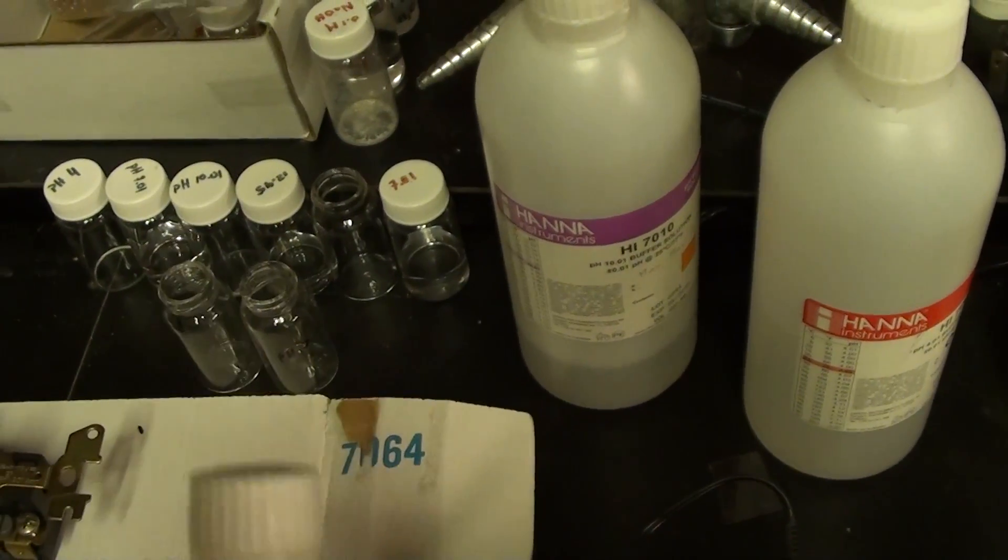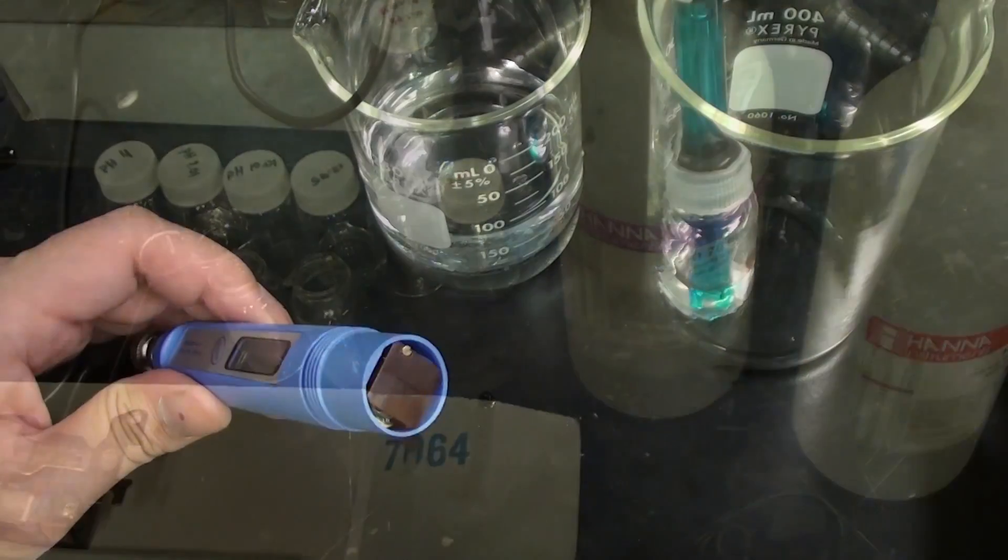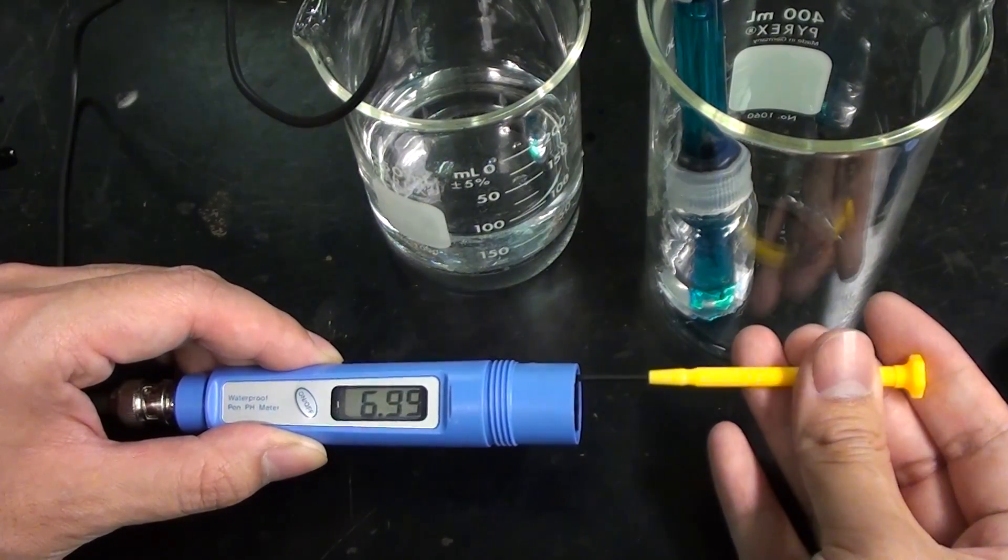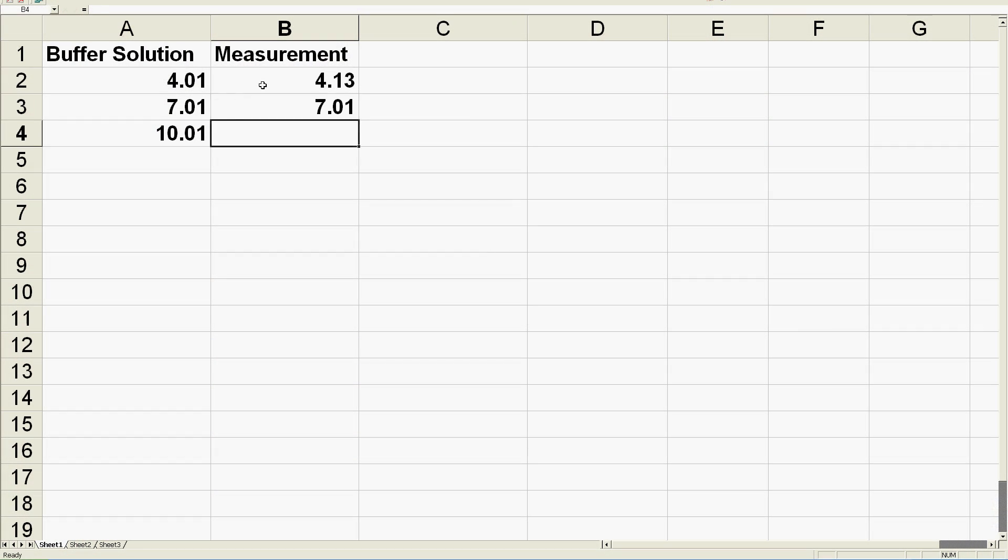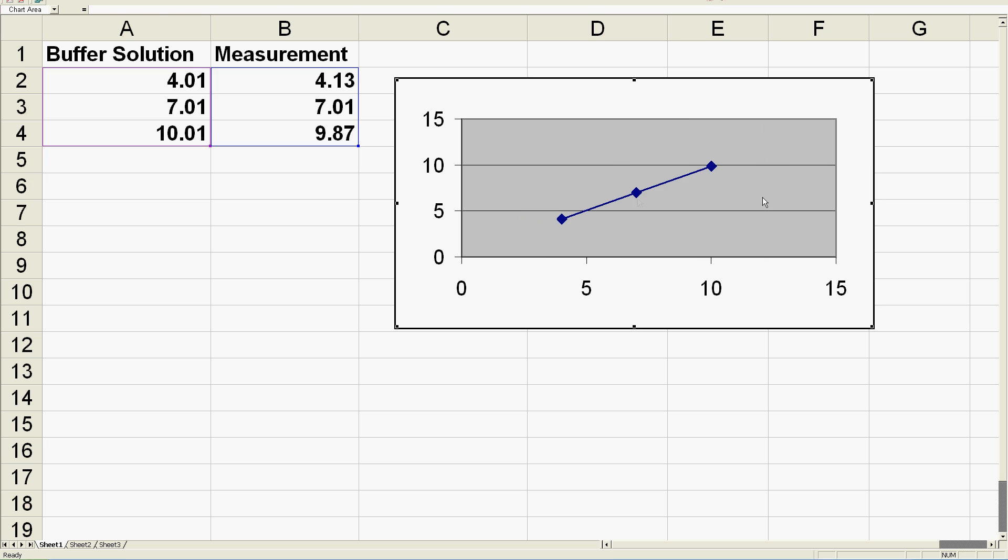First, get a few different pH calibration buffer solutions. I'm going to use three. After physically calibrating your meter with one solution as best you can, measure all three solutions and then plot the measured readings versus the known pH as a scatter plot in a spreadsheet.